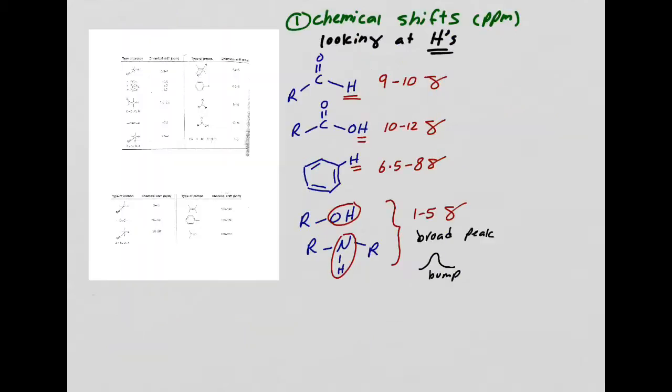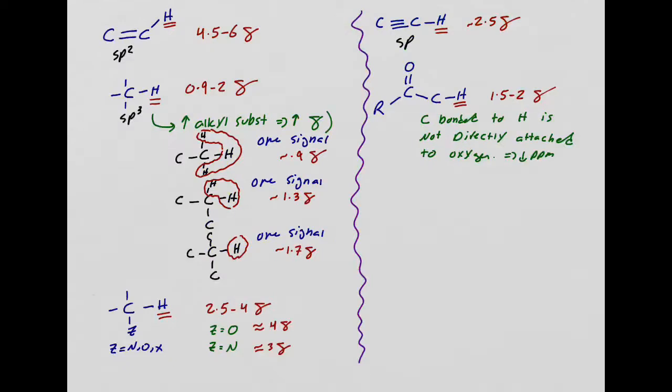Okay. So this over here that I have given you guys, this one down here is carbon NMR. Don't worry too much about it. But here is what I want you to look at. We almost went over the entire thing. So you should have this in front of you. I kind of like this. You should definitely have this in front of you as we are going over different NMR spectrum. All right, so that's the first thing, chemical shift.